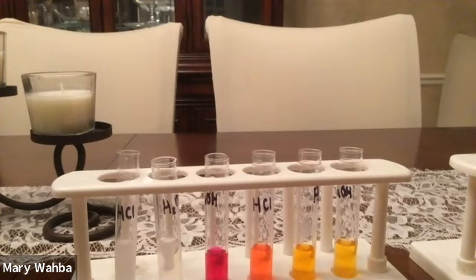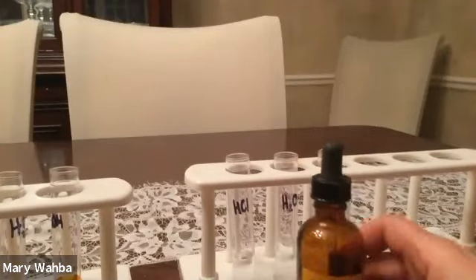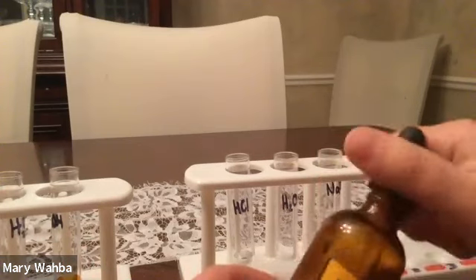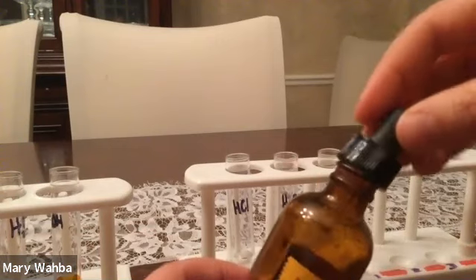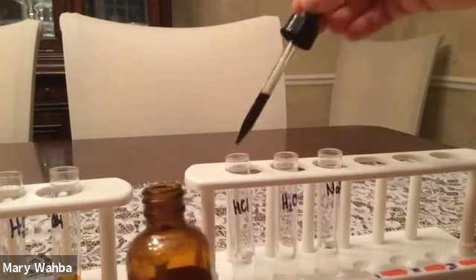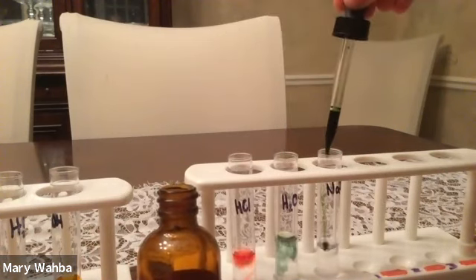And then my favorite indicator, my absolute favorite, is universal indicator. So universal indicator is my favorite because it turns all colors of the rainbow. So I'm going to go ahead and do the same thing. I have HCl, which is an acid, water, neutral, and then NaOH, which is the base, and I'll put a couple of drops in each of them.